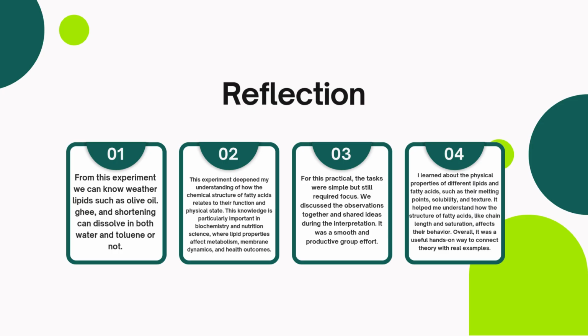Now we go to the reflection part for this experiment. Firstly, from this experiment we can know whether lipids such as olive oil, ghee and shortening can dissolve in both water and toluene or not.